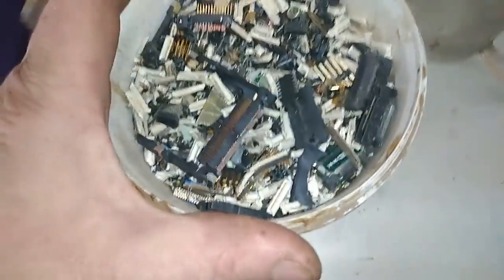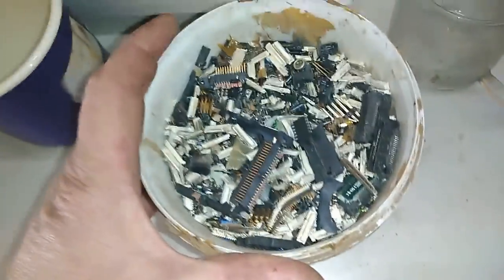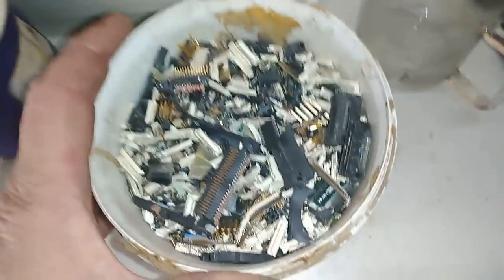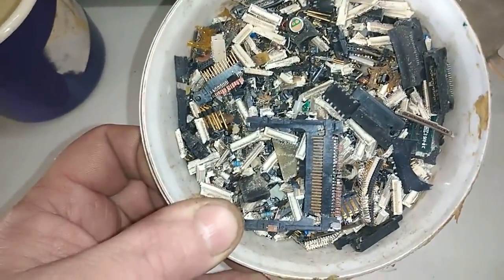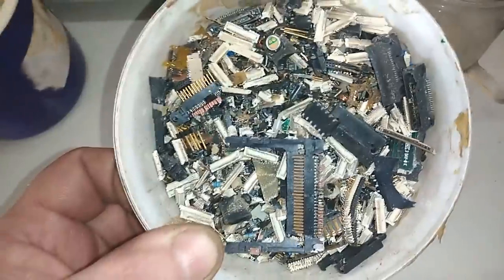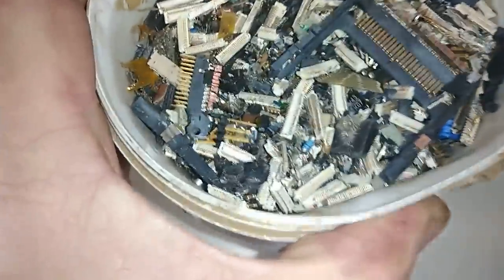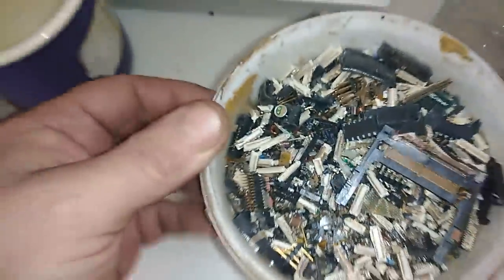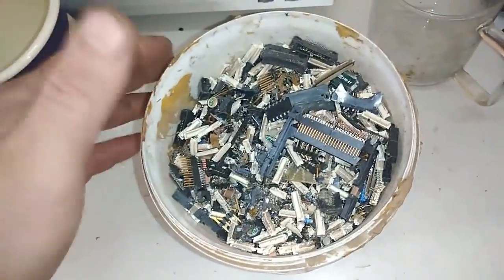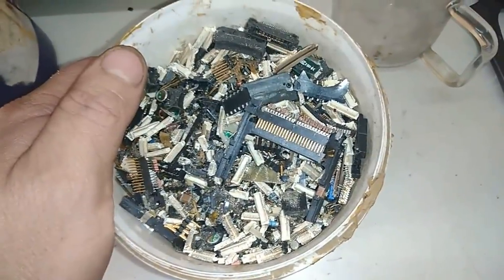The first thing I'm going to do is boil that to remove anything. I will boil it in hydrochloric acid — 33 to 35%. Then I will boil it for maybe one hour to remove any trace of tin, even from the ceramic oscillators. Any trace of tin. After that, we will go easy. So let's go boil that in the hydrochloric acid.